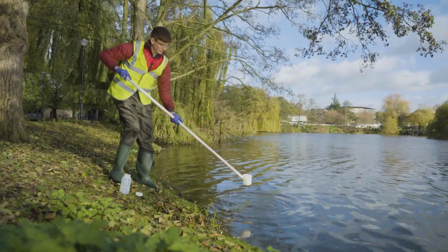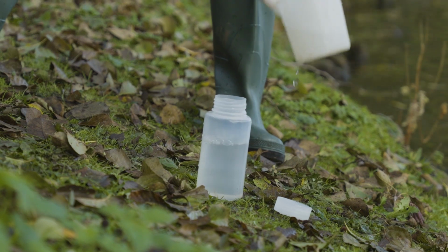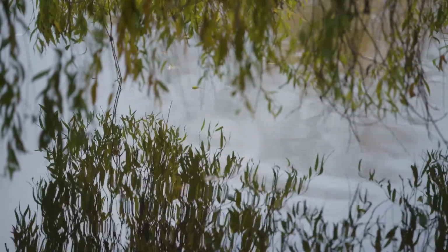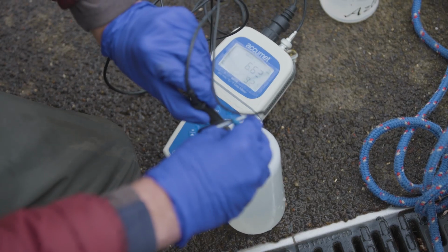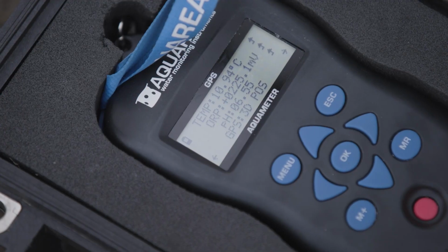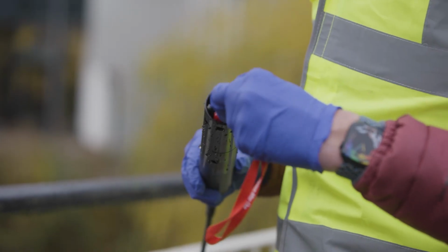However, samples may not be as spatially or temporally representative, as they will be taken at one specific time and place. For example, with an intermittent discharge scenario, you may not capture the chemical pollution event. There are also a suite of in-situ measurements that can be undertaken. The best option is to use a multi-parameter sonde that provides information on things like the pH, conductivity, temperature, dissolved oxygen concentration, and turbidity of the water at the sampling location.